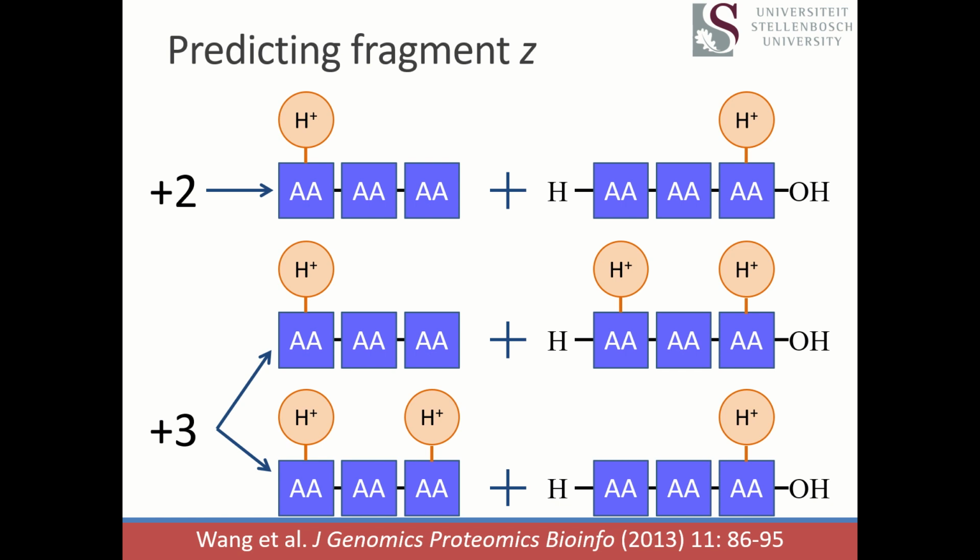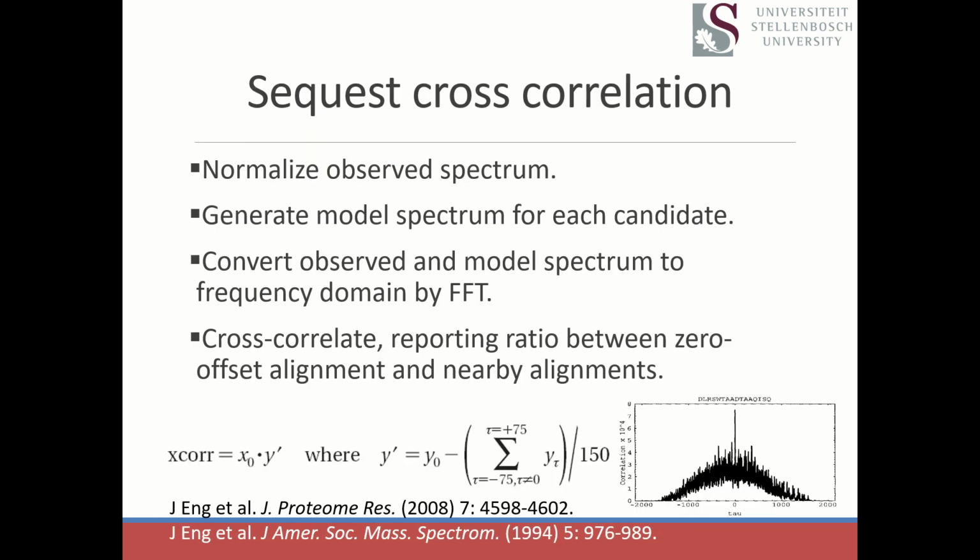Okay, so how we predict fragment ions is generally very well conserved among all the different engines that we use. How do you decide in the end that a predicted spectrum looks like what the observed spectrum looks like? So we have, at this point, 2 spectra. It's just one was generated in silico. We predicted what this sequence should look like if it were a tandem mass spectrum.